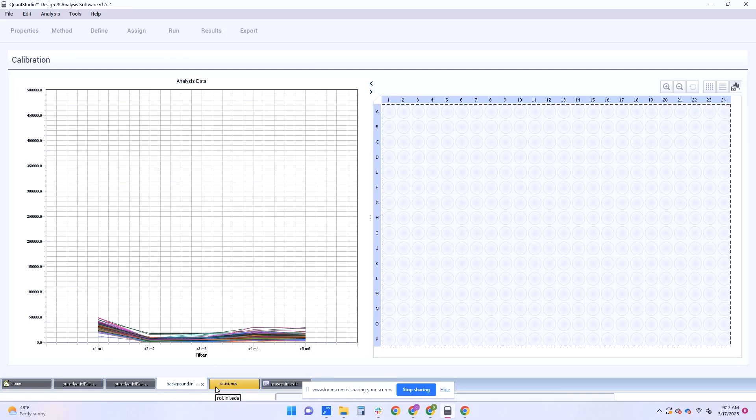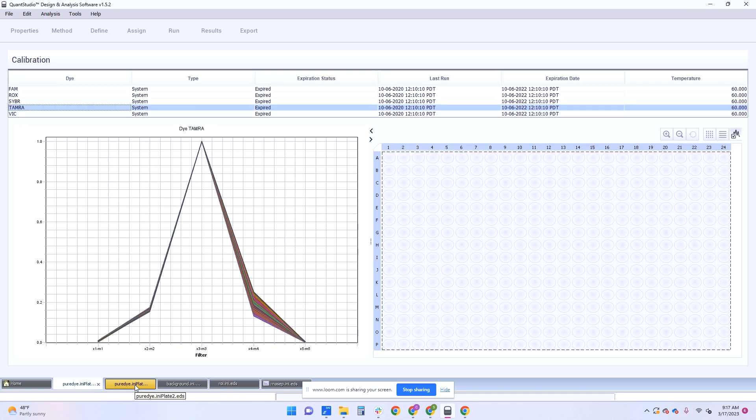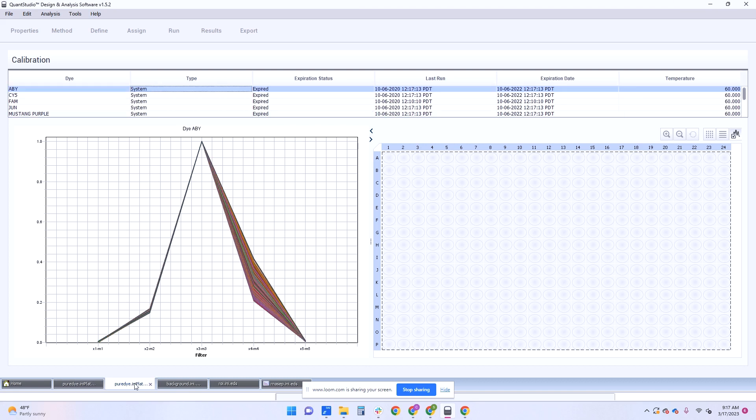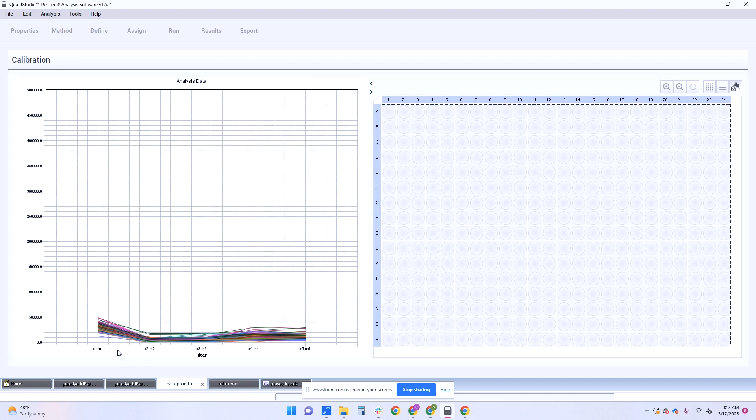In the last video, I showed you how to do a dye calibration. In the section where it says ROI and uniformity, there is a background check in there. So here are all the calibration files that come from that instrument. I have the dye calibration here and then I also have the ROI over here and here I have the background.